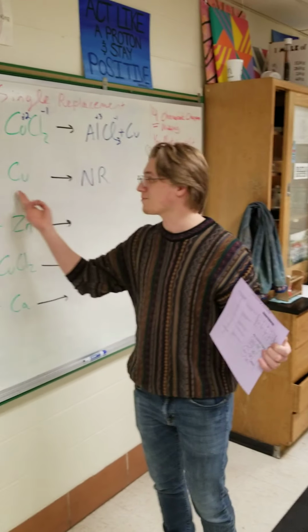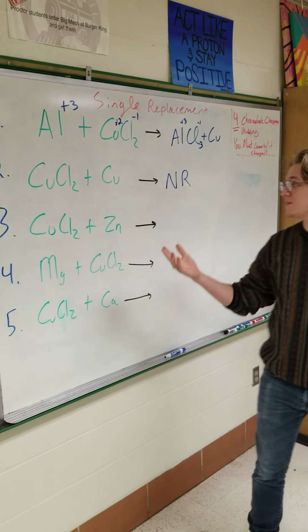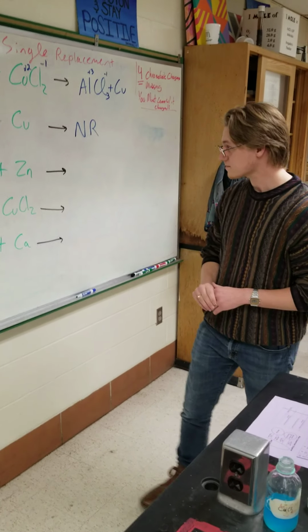And since copper and copper are the same, this copper is not more reactive than that copper, so therefore it's not going to replace it. Nothing's going to happen. It's going to be a no reaction. So we're going to have more examples of those on your ChemQuest.